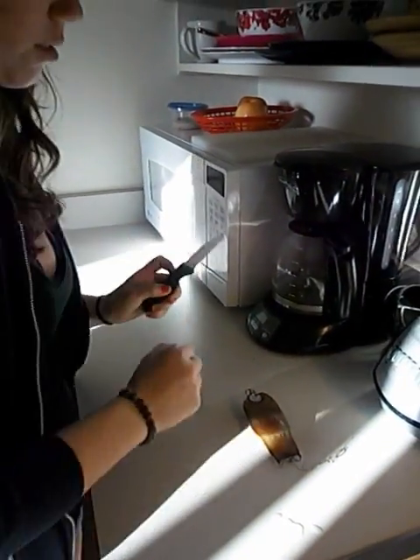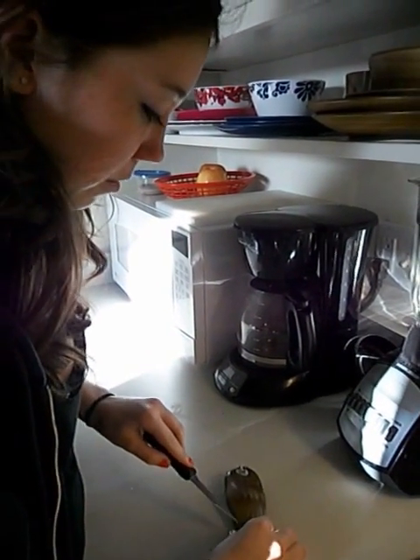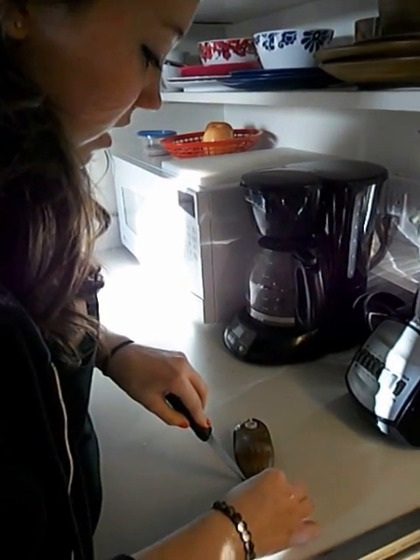I'm just gonna — should I use a cutting board? No, that's gross, because we used that cutting board. So I'm just gonna make an incision.